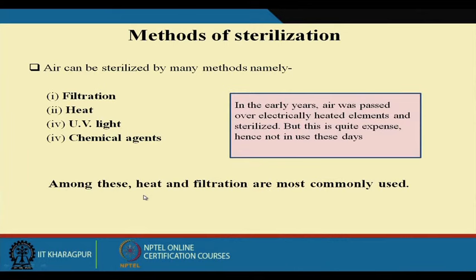So in this lecture, mostly I shall concentrate on the contaminants present in the moving air, because heat is no good for the sterilization of the air. So filtration is a kind of physical separation process through which we can separate the particulate matter or cells present in the air.